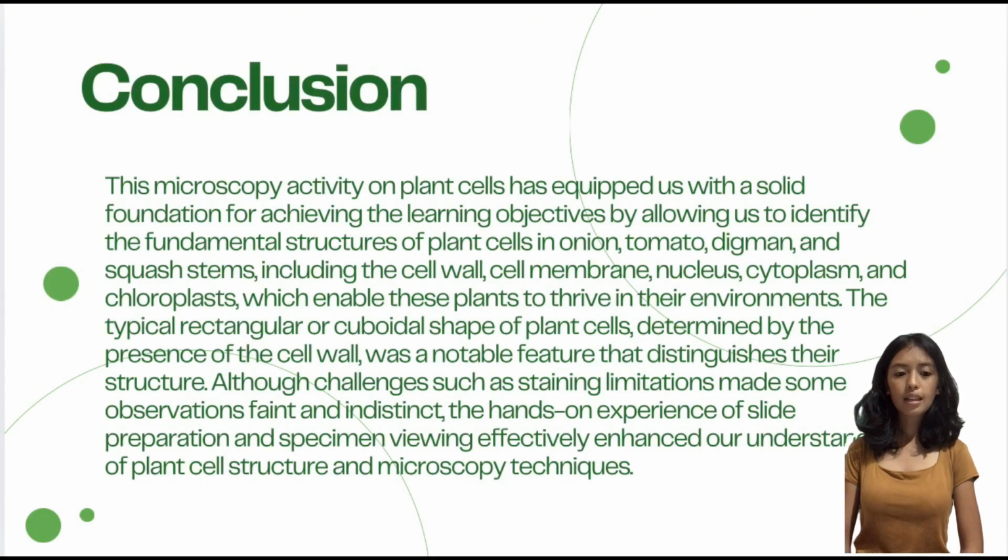the activity successfully strengthened our microscope skills and deepened our understanding of plant cell structure and diversity. Overall, the laboratory exercise enhanced our observational ability, improved our competence in slide preparation, and provided valuable hands-on experience in studying plant tissue under the microscope.